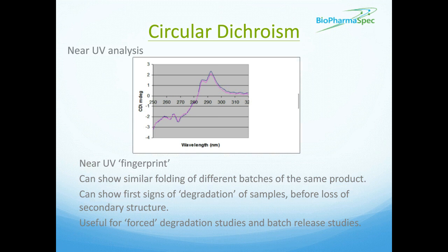It also can be very useful when you're doing your early phase force degradation, because quite often you actually lose your tertiary structure before you lose your secondary structure. As I said, as a result, it's useful in force degradation studies because what you're trying to do there is prove that not only are your molecules similar in the shape and function that they have, but also in their degradation profiles of how they fall apart. And again, that gives you more confidence in the fact that your molecules are actually the same or similar.